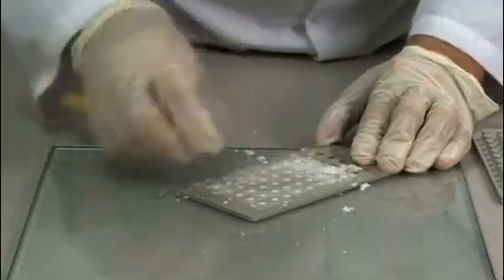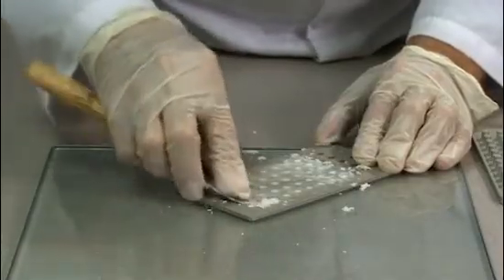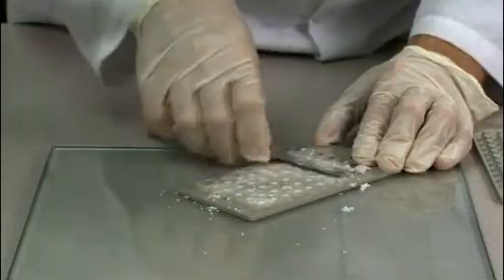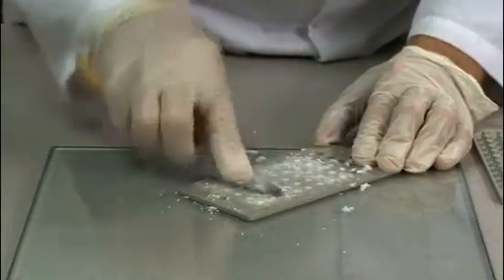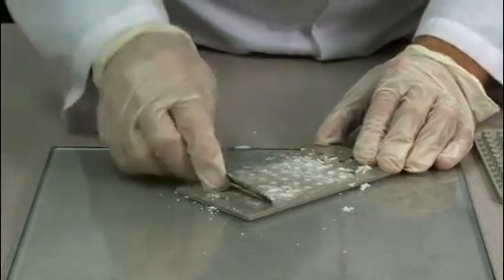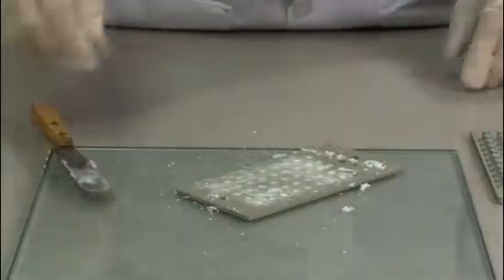Continue to fill as many holes as you can, looking back at previously filled holes, and if there's an obvious gap, go and fill that tablet. Fill as many holes as you can.